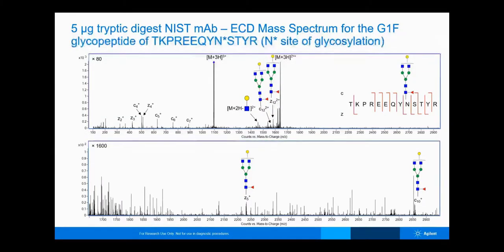So we can see from Rebecca's example here that these spectra can really be quite complex, and we're going to be relying really heavily on our data analysis software in order to extract as much information as possible and really minimize that manual interpretation. Before we begin, my name is Cody Schwarzer, and I work with Rebecca and Emission to help develop some of the data analysis workflows that we'll be using for the EXD Cell.